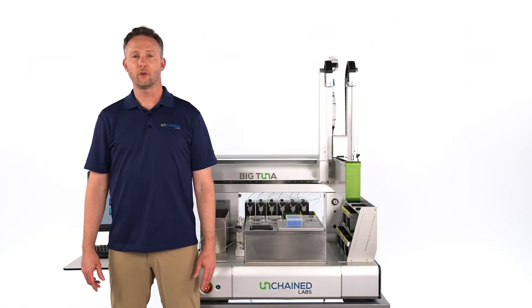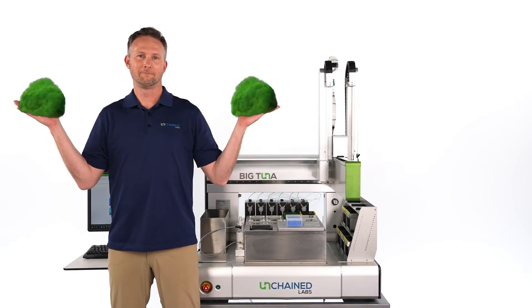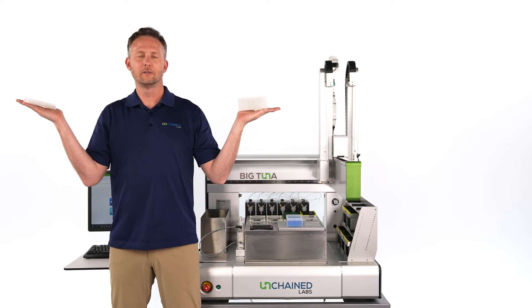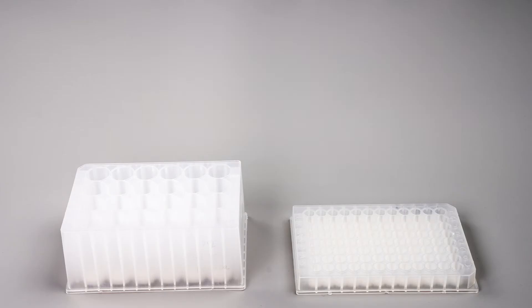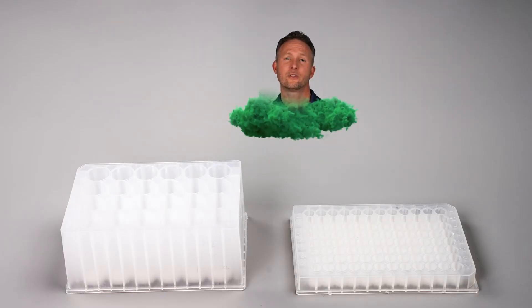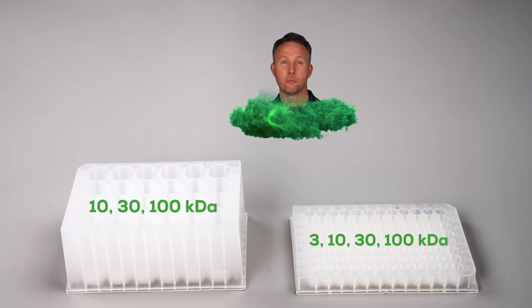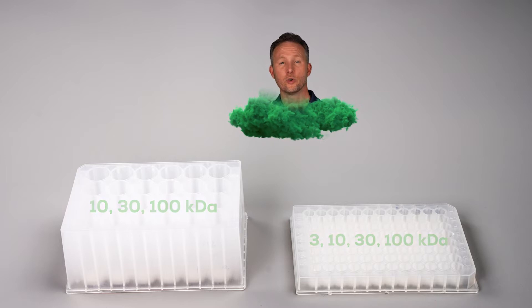But now there is a better way. Let's go see how it works on Big Tuna. Kicking off a run starts with the Unfilters. Unfilters are plate-based consumables with a regenerated cellulose membrane. They come in two different formats that let you exchange and concentrate 24 or 96 samples in parallel, and with a variety of molecular weight cut-offs to choose from, you'll always have the right Unfilter for your sample.